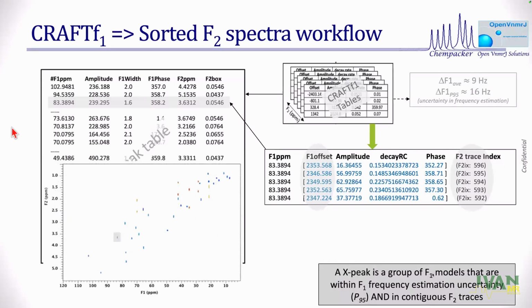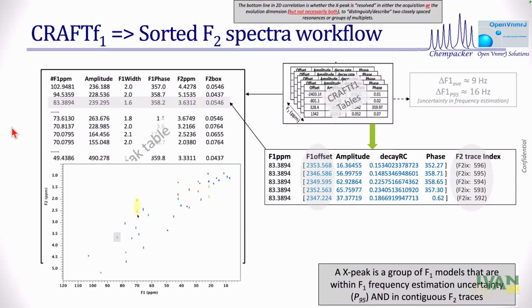Once I have that, that peak essentially represents that two-dimensional table, a table along the plane of the paper, which represents this cross peak. I can do that for everybody. One might question, what about something like this? There are two cross peaks that have the same F1 chemical shift. That's a methylene, obviously. That violates this rule. So they belong in two different drawers of your cabinet.